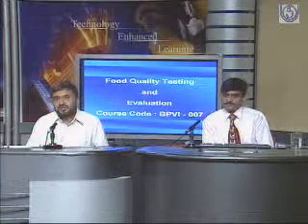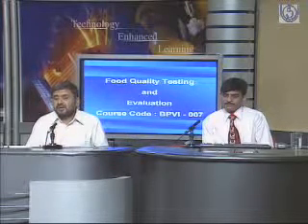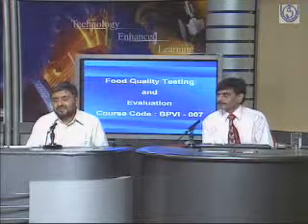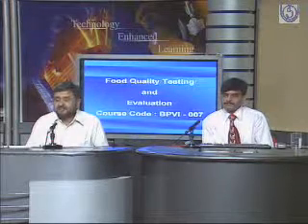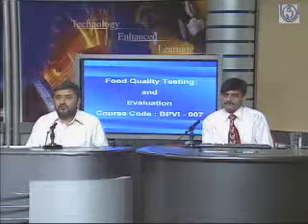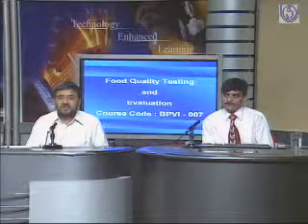And in microbiological, the plating, the coliform count, and the direct examination under the microscope. Then he also covered the sensory evaluation, how we do it, and he also touched on the new electronic nose and how the panels should not be biased.